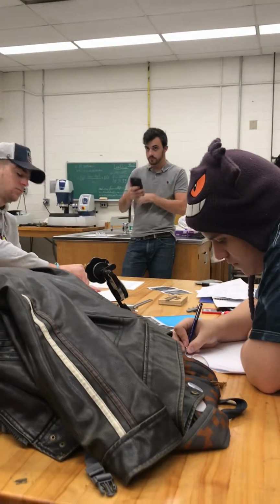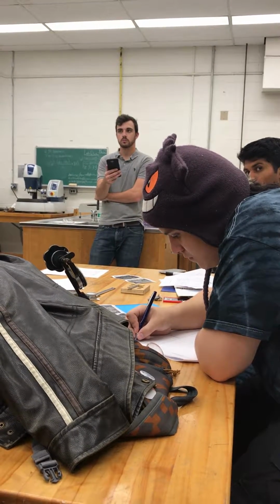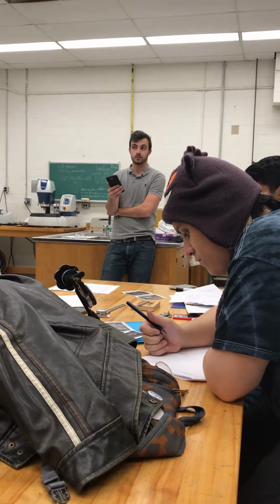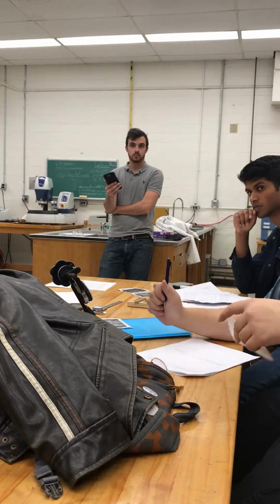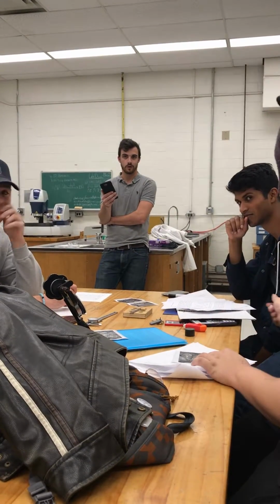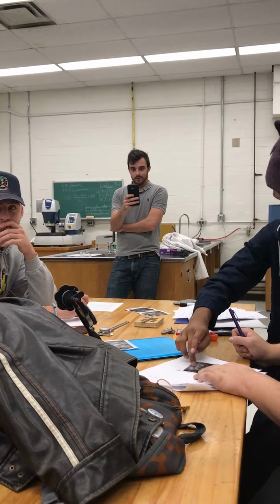What do we write under the direction of force applied? I want you to indicate it actually on the micrograph. If you've already indicated it, you can either draw a grain size and indicate it, or you could indicate it on the micrograph itself. I don't care how you do it, just indicate it. So I need arrow directions. Take a pen and draw the direction of an arrow where it was compressed. Yes, once you outline your grain structure.